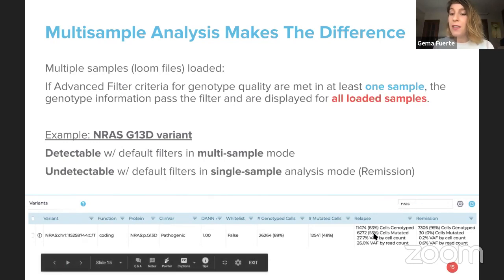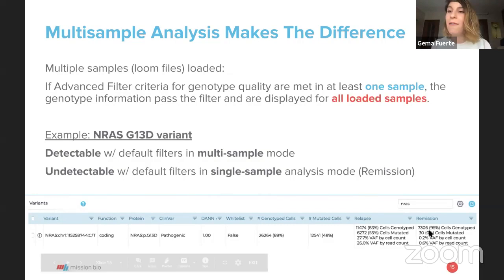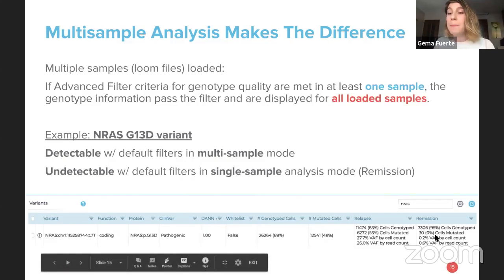As you get the percentage of mutated cells across different time points, the more time points you have, the more supporting information you have about how important that specific mutation is over time. Because you could go from 90 to 0 to remission, then to relapse to 20, and then perhaps you have a second remission. So the more, the better. But as I said, it is not a must to have multi-sample, but if you had 3 or 4, you will also get nicer fish plots.